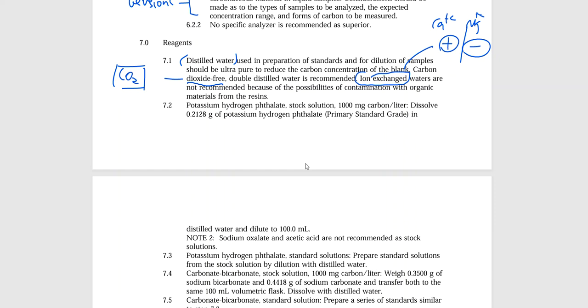As of currently, we do not have a proper distillery. We are not using distilled water. Distilled water is way cleaner than deionized water, according to the definition, and that's because we are getting rid of those organics that might be present in that water sample. Now, there are different water sources out there, with different purposes for each one of them, but for today, ion exchange is the only thing we're going to refer to.